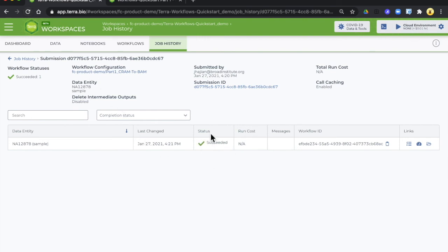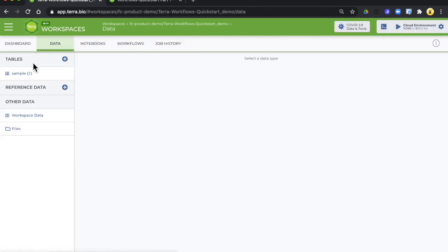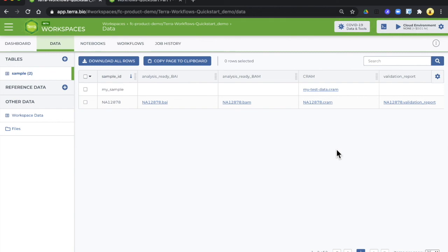Going back to the data table to expand the sample table you notice there are now three additional columns. An analysis ready BAM index, an analysis ready BAM, and a validation report. In the next part we'll talk about how these showed up in the data table.